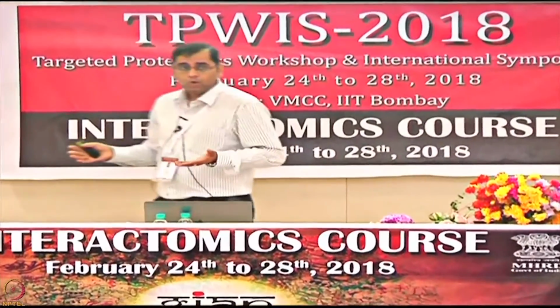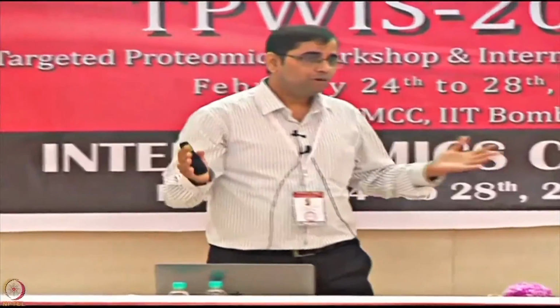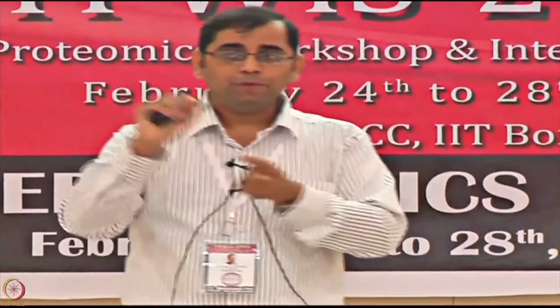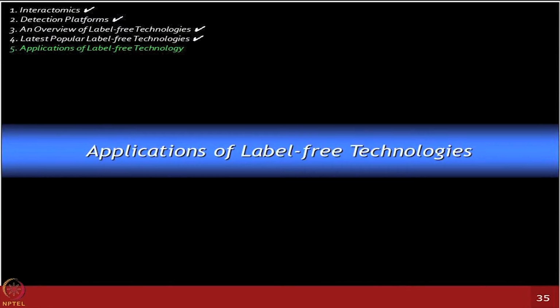So a good approach can be: from the microarray experiments you have got leads, let's say 200 molecules which are of your interest now. You can go to BLI to narrow it down further. Now you can probably use Biacore to test how many of those you want to measure for the exact on-rate and off-rate, right? Okay, so there are many label-free platforms which are possible.